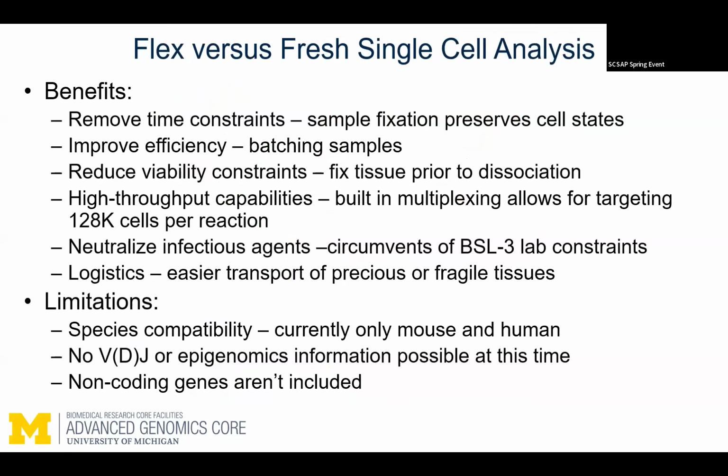So this is just some Flex versus fresh things to think about. As long as all you're looking for is gene expression of a sample, Flex is the way to go. We have quite a few people who said, you know what, yes, I am just looking for gene expression. I'm going to run this pilot. And we're like, well, instead of a $5,000 experiment, how about you run a $7,000 experiment and you get pretty much your whole experiment done in 1 sample set, because the Flex does bring our cost down to about $750 a sample, as compared to the library prep for a fresh sample is $1,900 a sample.